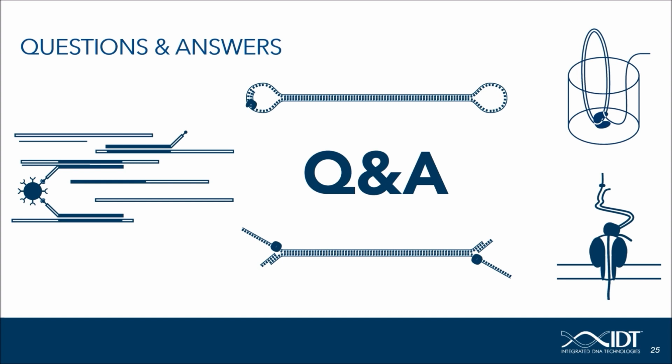Thank you for your answer. I have another person asking something very interesting: I have done some bead-based size selection with standard AMPure XP beads for short read libraries, but why do you prepare specific size selection beads by yourself? What's the difference?